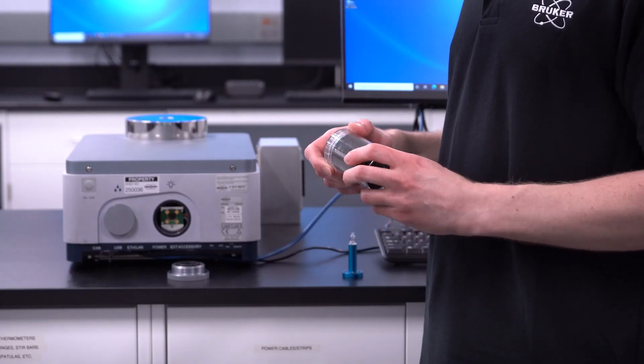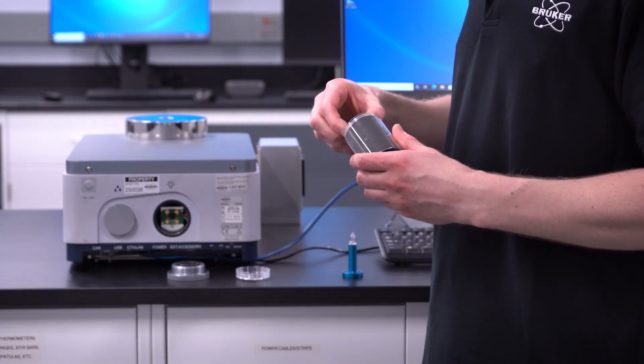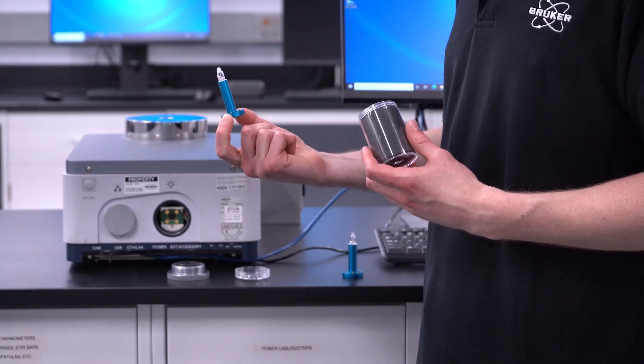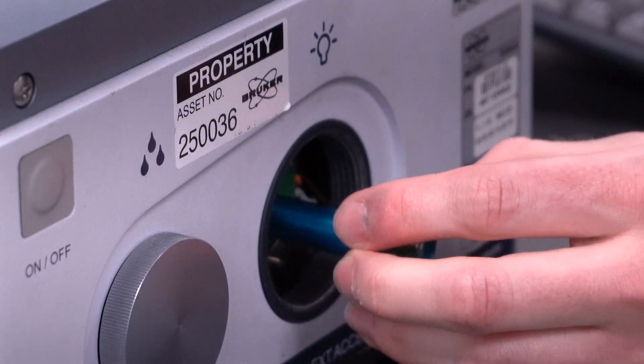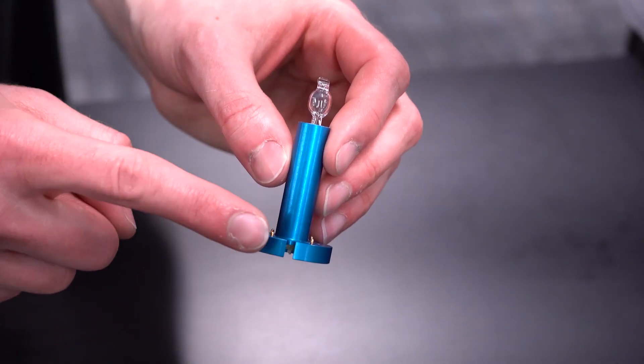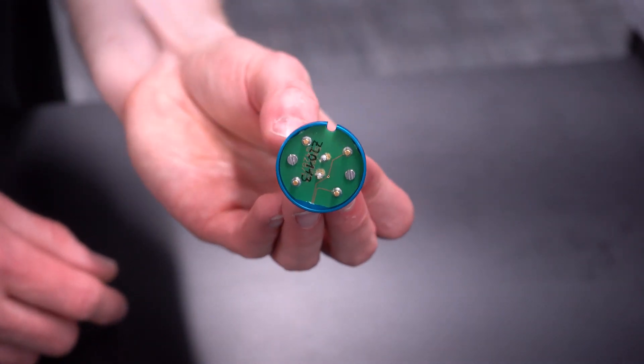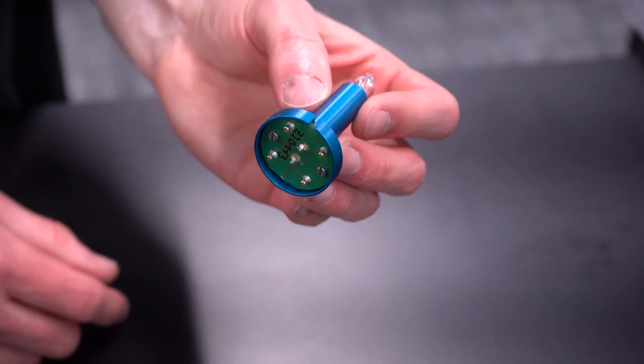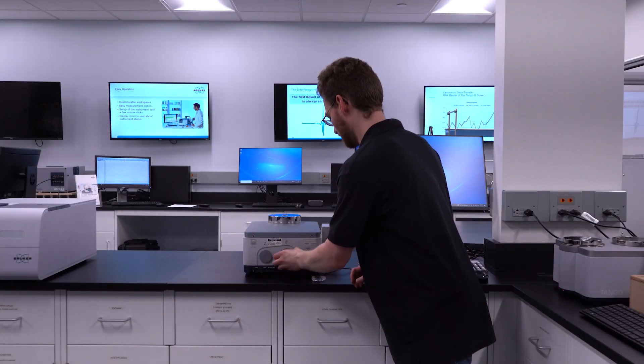Our light source comes in a single piece which makes it easy to install. The light source is as simple to replace as inserting the light source. There's a notch that prevents you from putting it in incorrectly, and then all you have to do is screw on the cap.